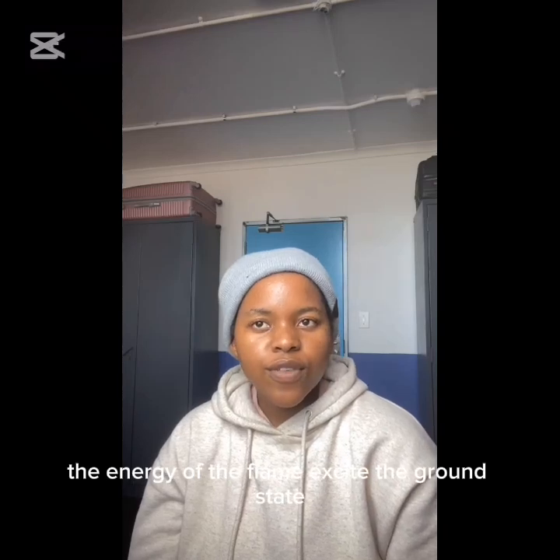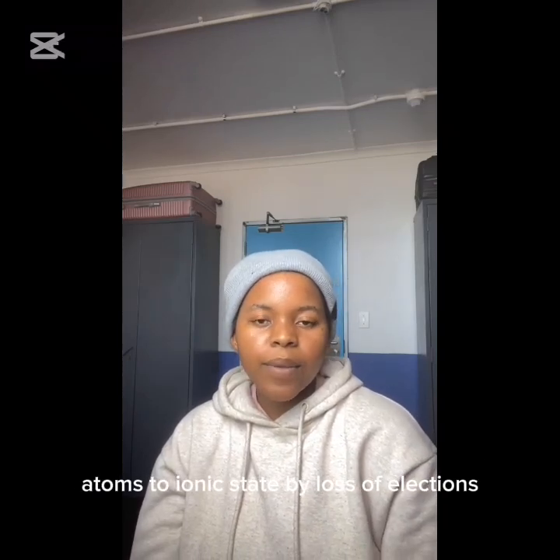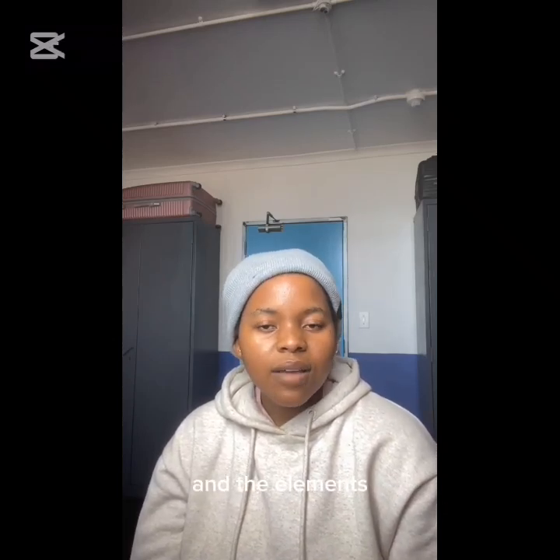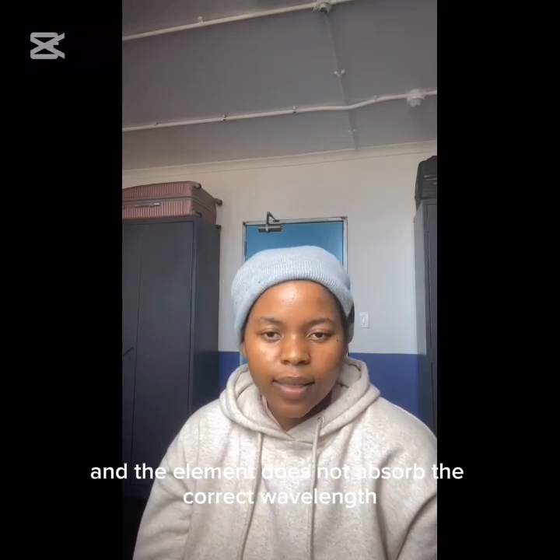The energy of the flame excites the ground state atoms to an ionic state by loss of electrons, resulting in a depletion of ground state atoms. And the element does not absorb the correct wavelength.